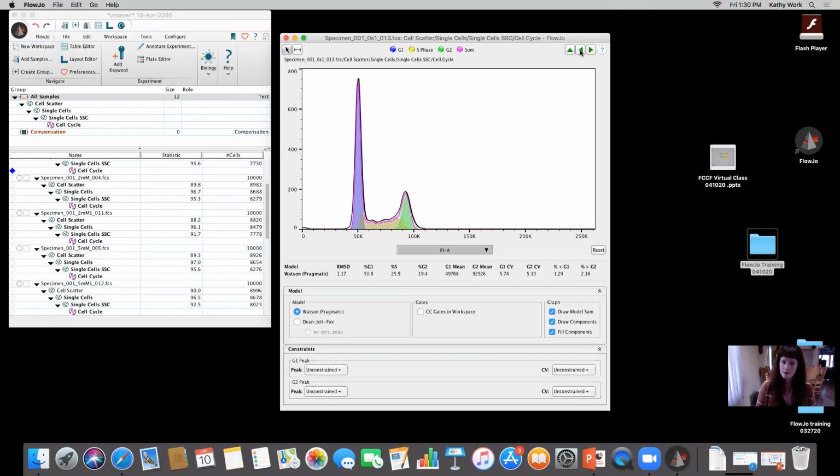What I'd always suggest, and you'll see we always make all these little comments, is optimize your experiment as much as possible from a technical standpoint, so that the modeling should hopefully work for all of your samples. If you do have to make modifications, understand there might be some implications to that. And Rui, please correct me if I'm wrong, or if you have any added comments for that. But if there's anything that's way different, try thinking if there's a biological reason for that and it makes sense that you'd have to make some of those adjustments.